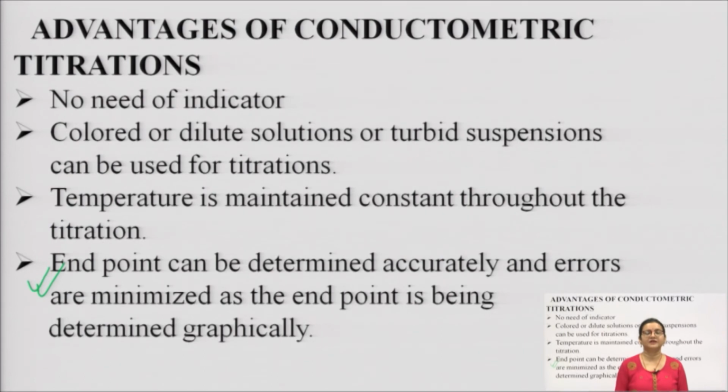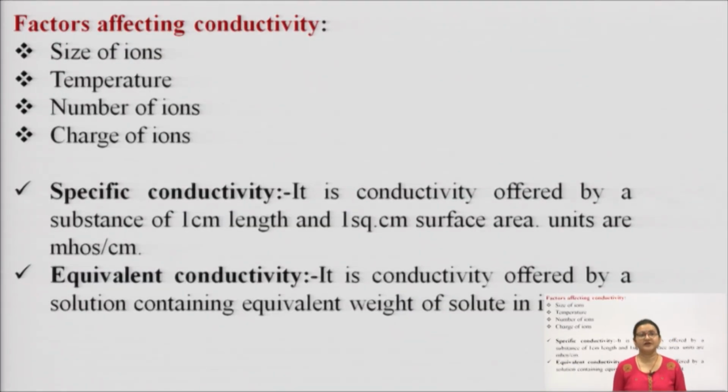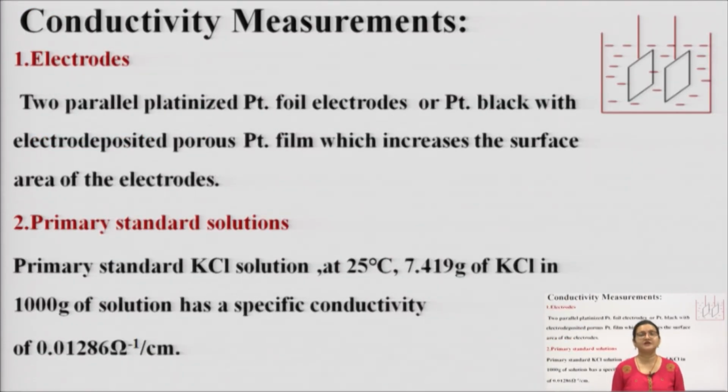So, we can summarize it. What is conductometric titration? Conductometric titration is a sort of titration which depends upon the measurement of generated current, which indirectly depends upon the measurement of generated voltage, and which directly depends upon the conductance of charged ions or number of ions present in the analyte. And what is that? That is, my dear, the concentration of the analytical solution, the analyte under study, or our test solution. So, that is what it means.